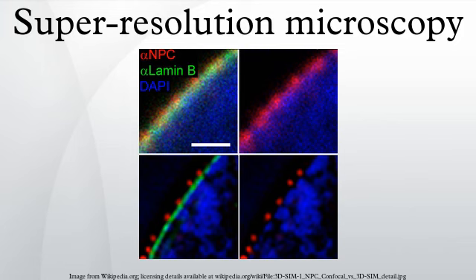Generally, localization microscopy is performed with fluorophores. Suitable fluorophores reside in a non-fluorescent dark state for most of the time and are activated stochastically, typically with an excitation laser of low intensity. A readout laser stimulates fluorescence and bleaches or photoswitches the fluorophores back to a dark state, typically within 10–100 milliseconds.